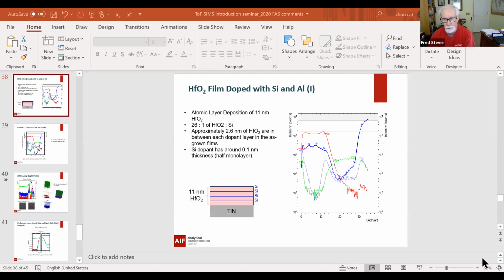For certain matrices, there is another approach. For example, for the silicon technology, we were successful in using ion implantation through a removable oxide layer. The peak of the implant was placed at the interface between the oxide and the substrate. So when you etched off the oxide layer, you now had a known amount right at the surface. If you've got a material where you can have something on the surface you can remove, then you can have a known concentration at the surface. But it's a rather limited subset. You're not going to be able to do that very well with an organic. For organic, it's going to be a really tough question.